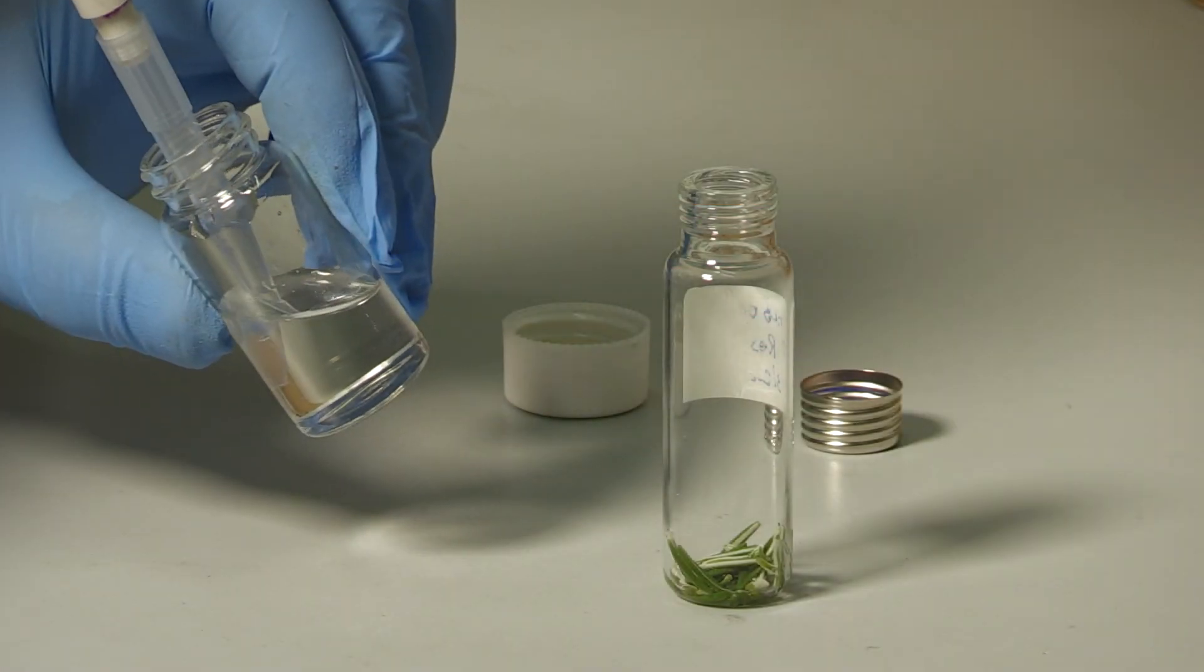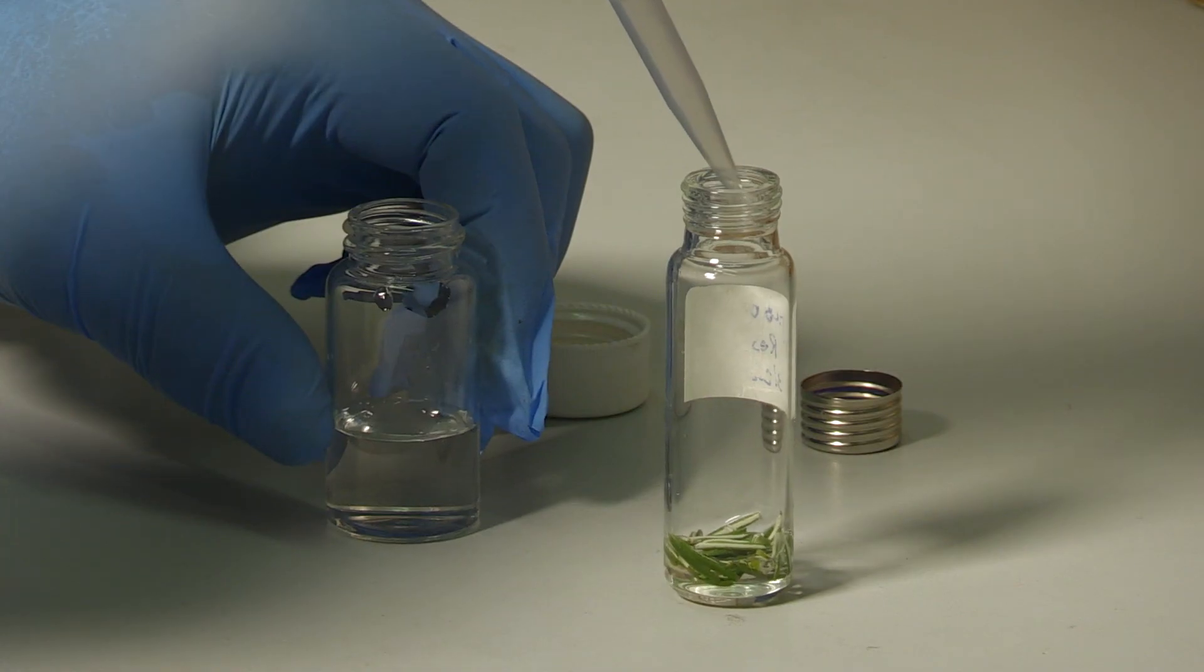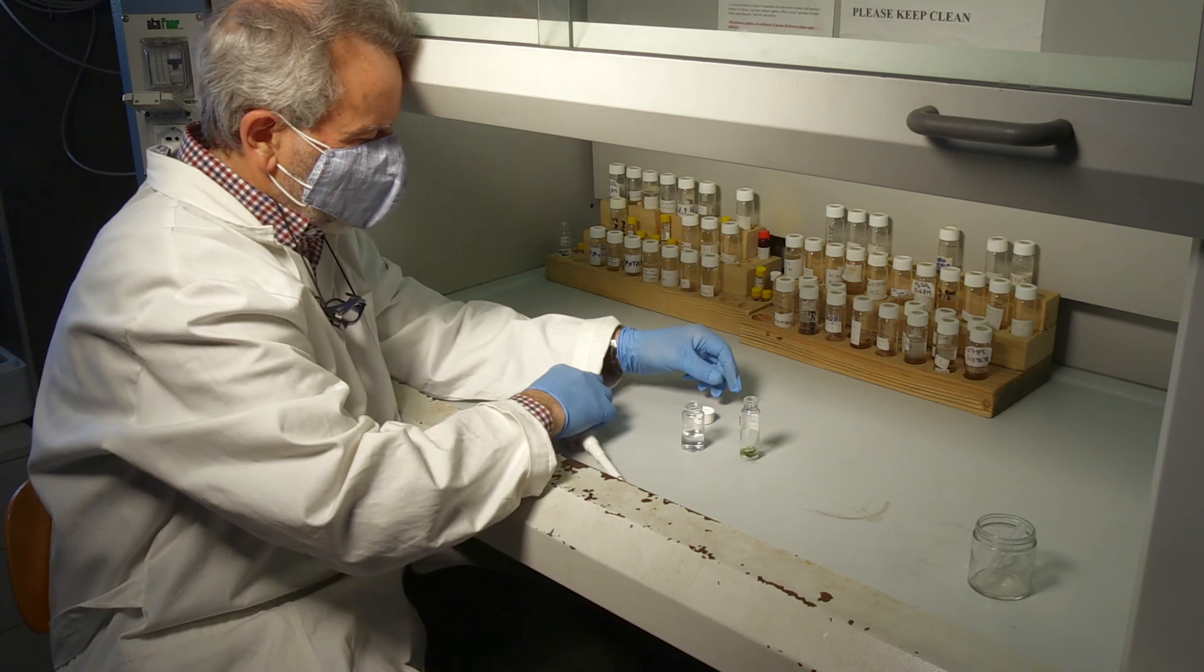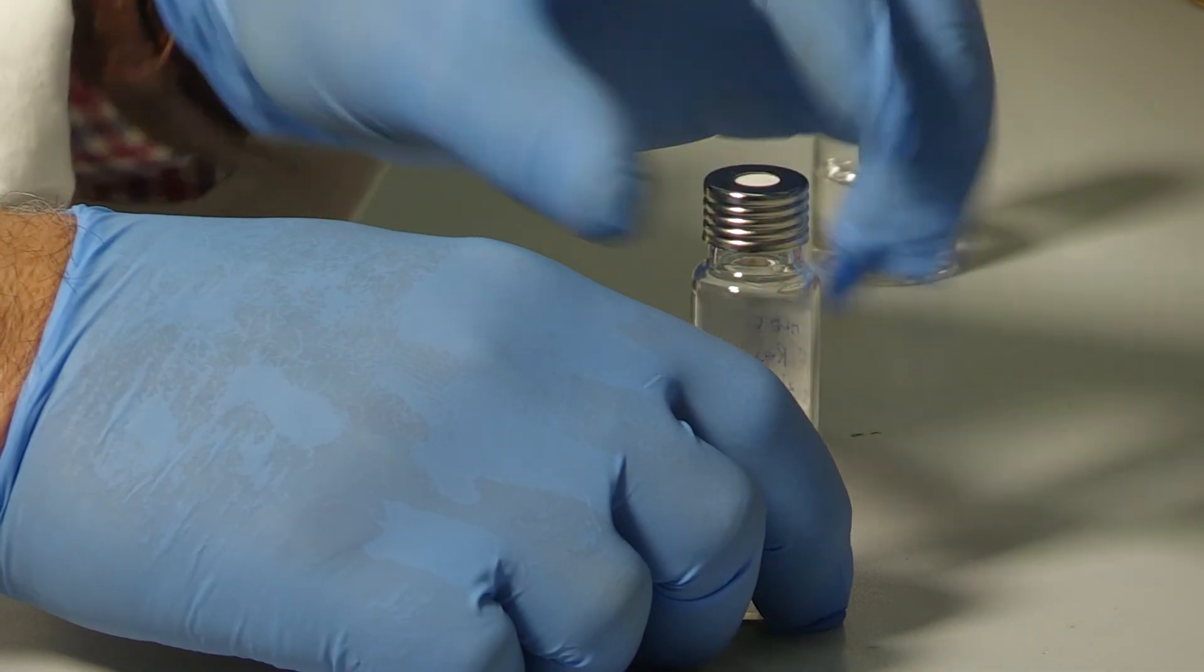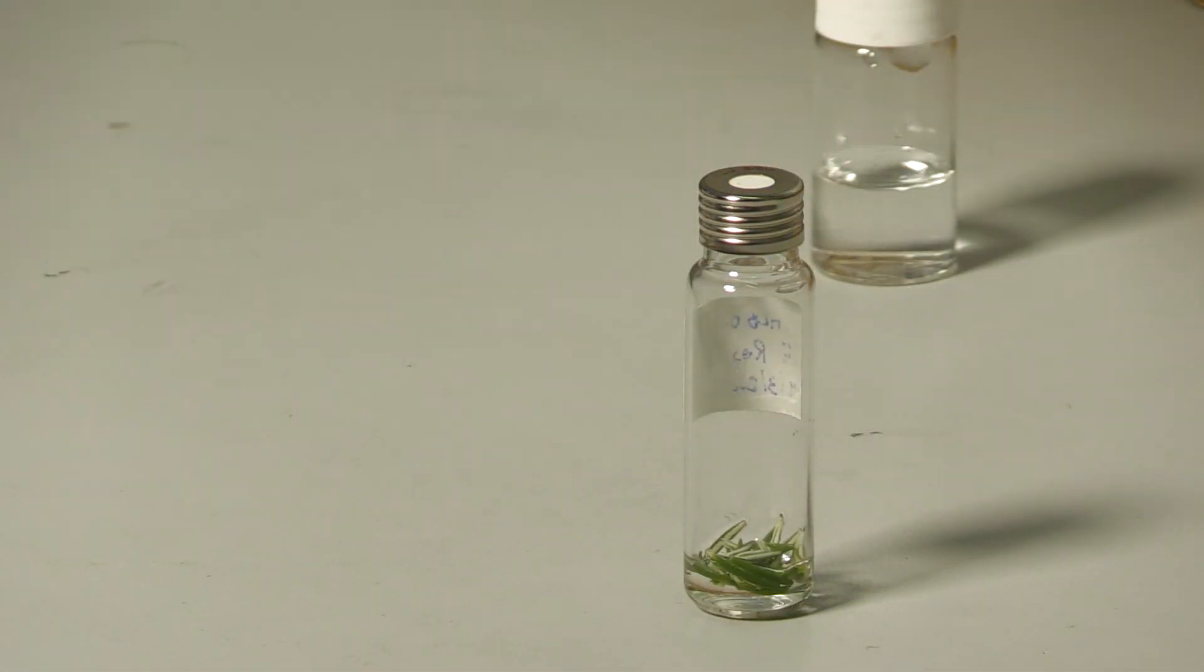To determine the chemical composition of each type of tissue, solvent extraction is performed. The material must be weighed and then an organic solvent is added to ensure the extraction of the volatile constituents from plant tissues.